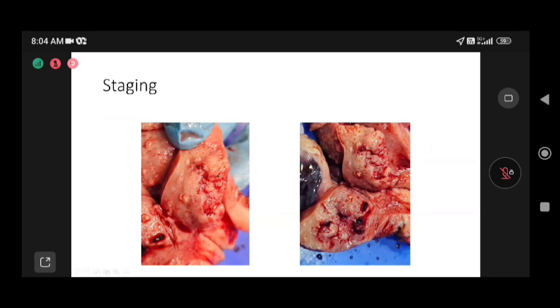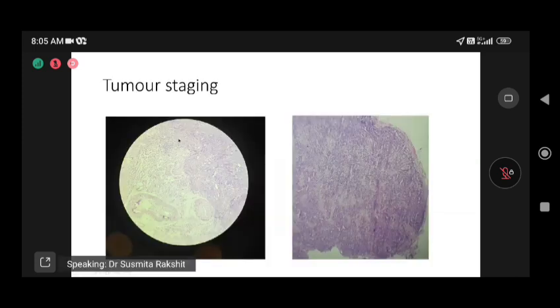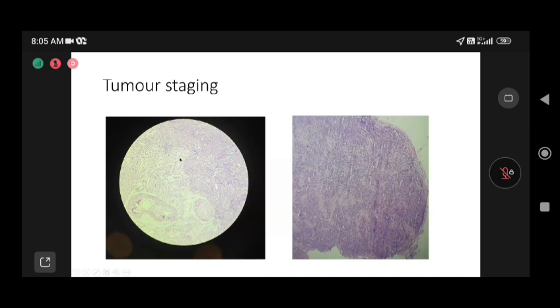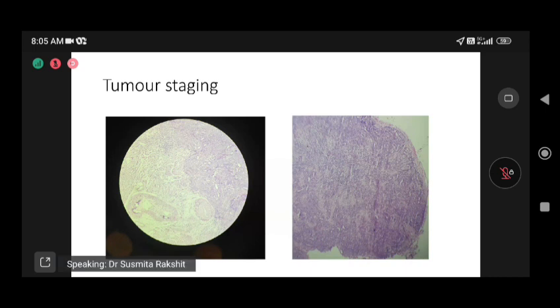Frozen section helps in staging. In this endometrial carcinoma case, we can see the growth and the full thickness of the tumor against the underlying myometrium — approximately 50% invasion on macroscopy. On microscopy, we assessed tumor clusters relative to a medium-sized vessel. At just about 50% invasion, we communicated this to the surgeon and noted we would take more sections on permanent to confirm whether it is Stage 1A or 1B. The lymph node was negative.